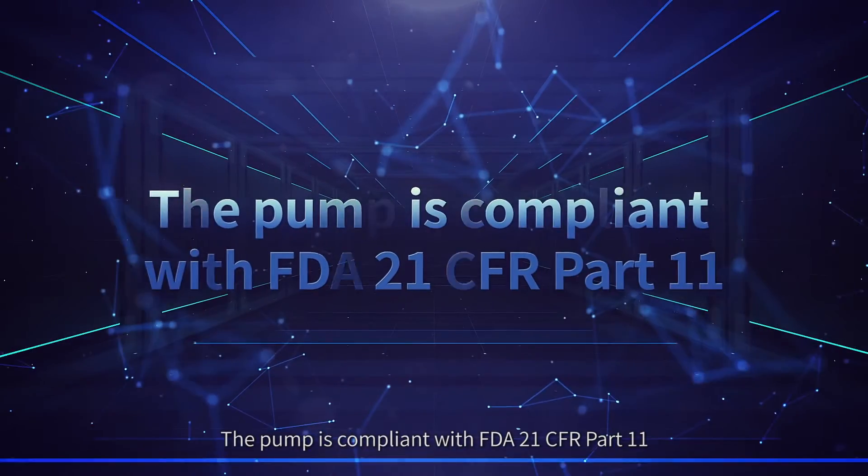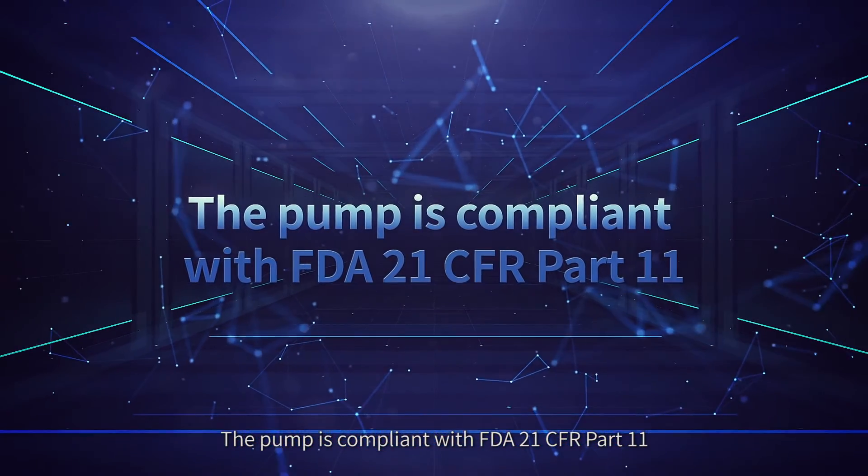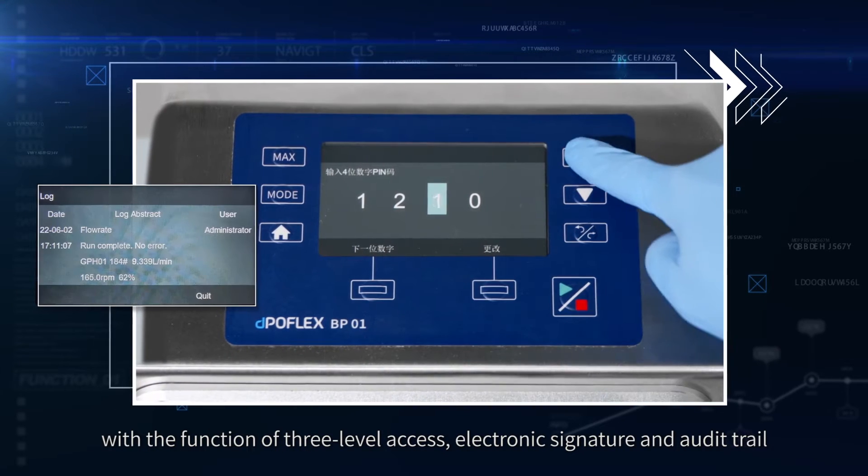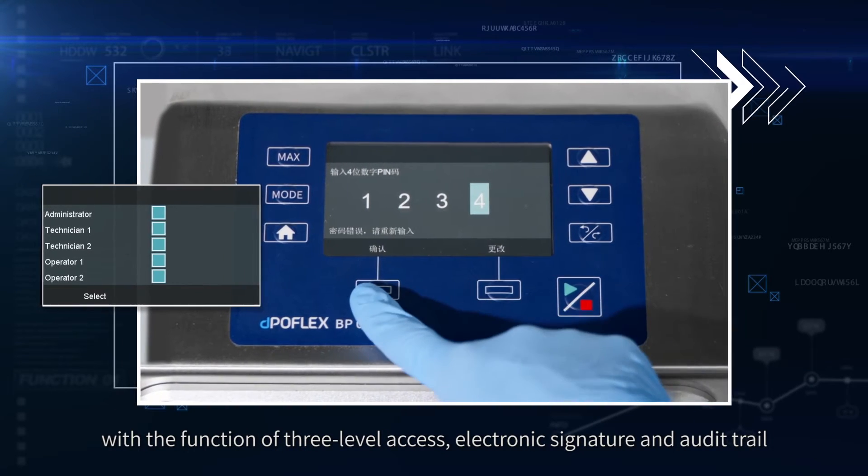The pump is compliant with FDA 21 CFR Part 11, with the functions of three-level access, electronic signature, and audit trail.